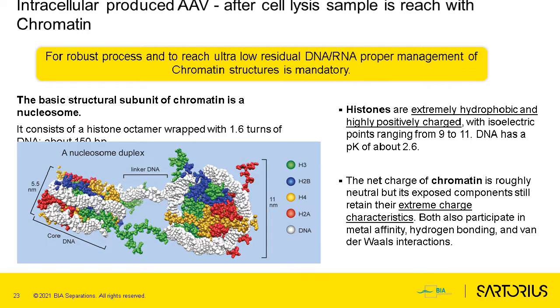And as already mentioned, PicoGreen is able to penetrate inside such a complex, and we can detect such DNA. It may not be possible to detect it by PCR, but we can detect it with PicoGreen fluorescent detection.